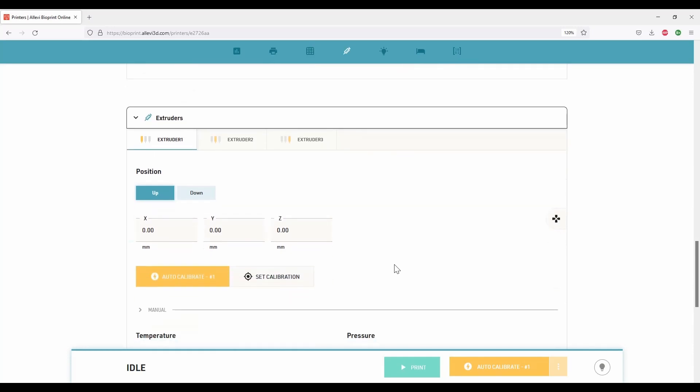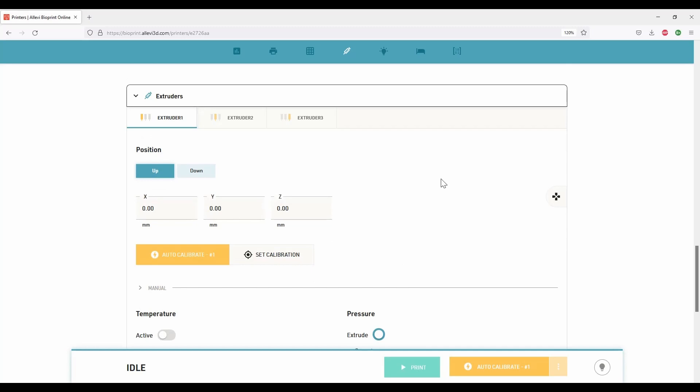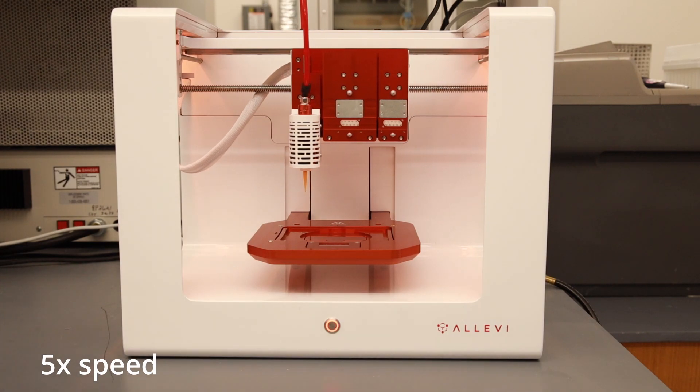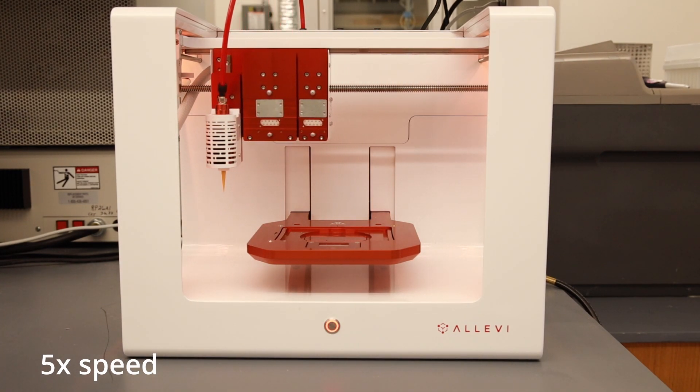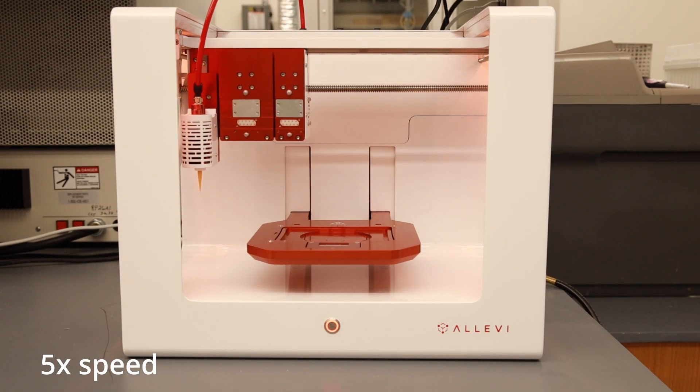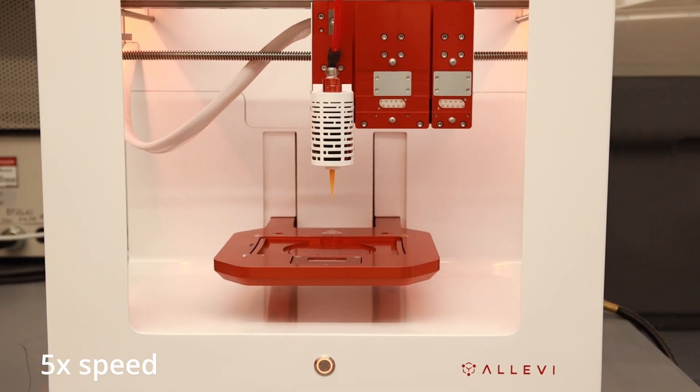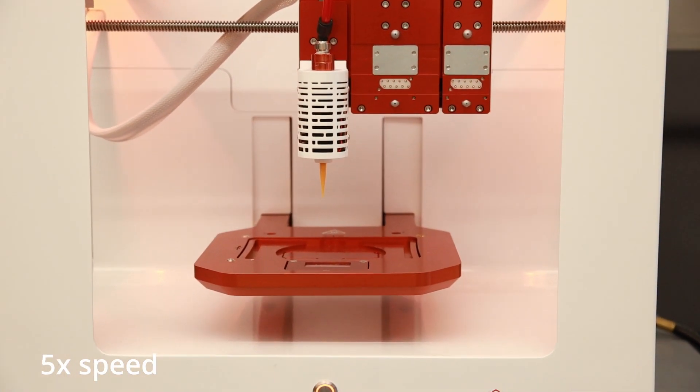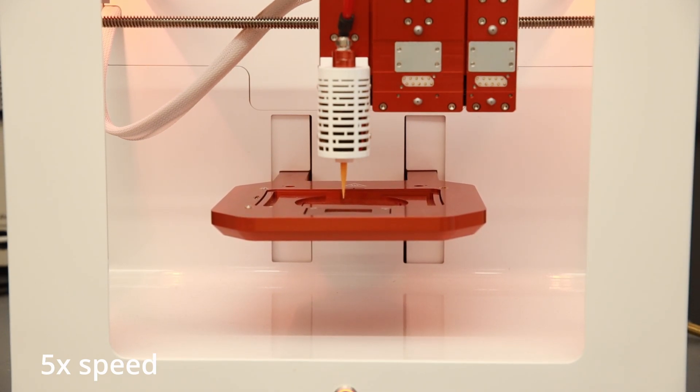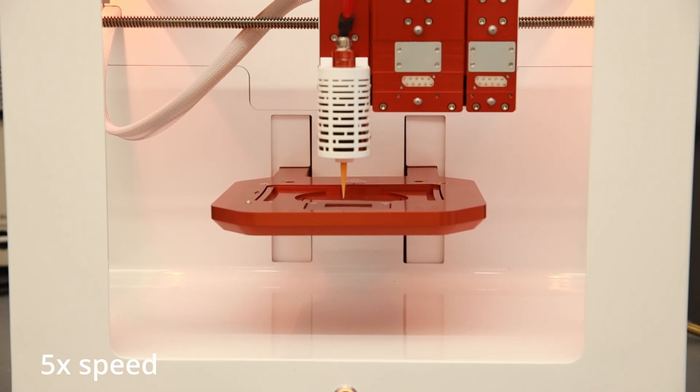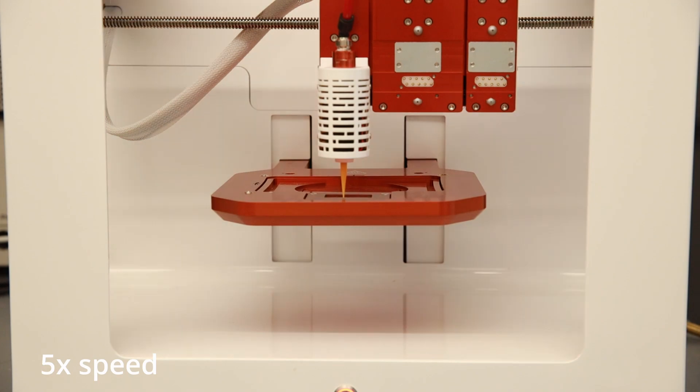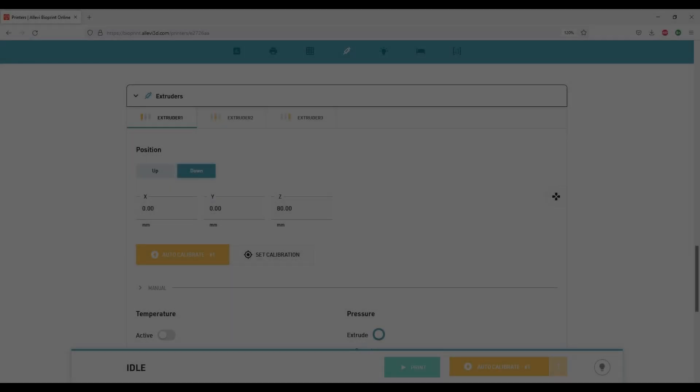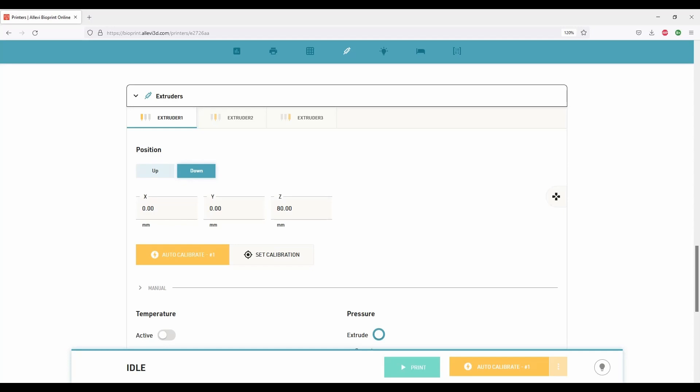Under the extruder section, we can calibrate the tip of the needle and optimize the extrusion pressures. The needle tip can be calibrated automatically or manually. If you are working with only one extruder, auto-calibration is recommended. To start auto-calibration process, click on auto-calibrate number one. For auto-calibration, please make sure there is no print surface on the print bed.